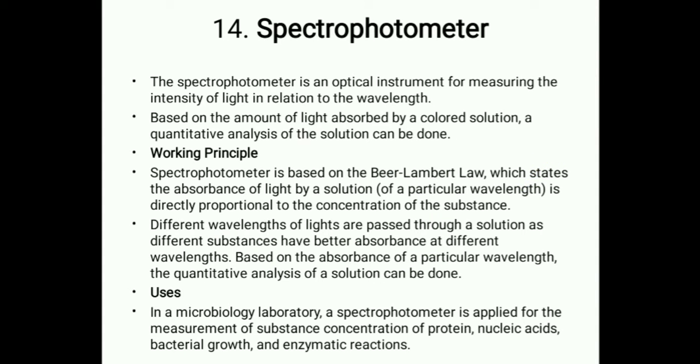So next we have spectrophotometer. The spectrophotometer is an optical instrument for measuring the intensity of light in relation to the wavelength. Based on the amount of the light absorbed by a colored solution, a quantitative analysis of the solution can be done.